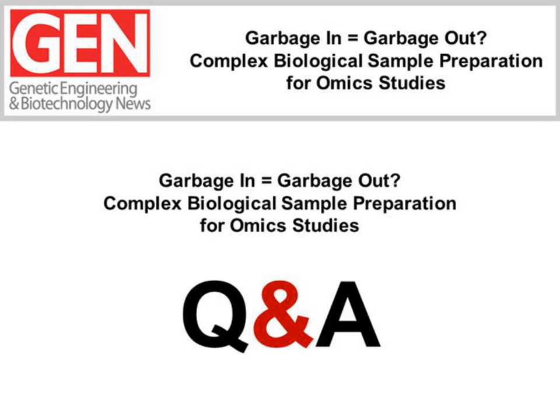Yes, I am. I hope I can answer this question, and I think I can. Let me start from the statement that since we developed and launched the protein quantification system, we've encountered quite a lot of questions about peptide quantification. What happens is this instrument is very sensitive when it comes to the quantitation of peptides. And what I mean by very sensitive is that it will pick up peptide impurities. If the peptide is super pure, the system will quantify it really correctly. However, if the peptide carries impurities, the system will show not one signal within the analysis region. It usually shows 2 or 3 peaks within the analysis region.